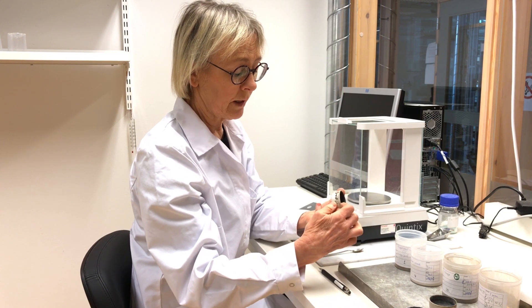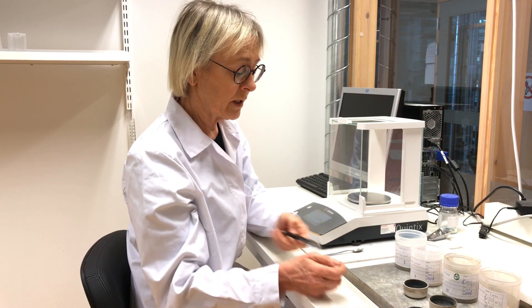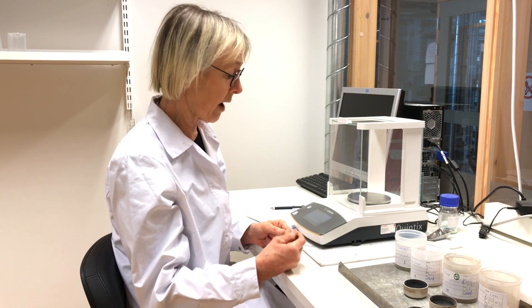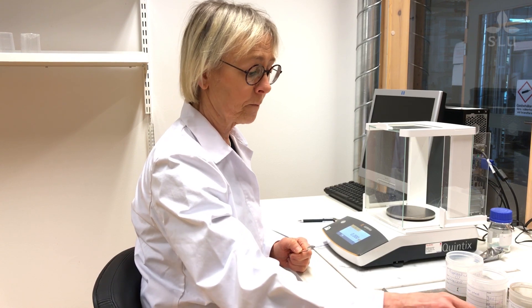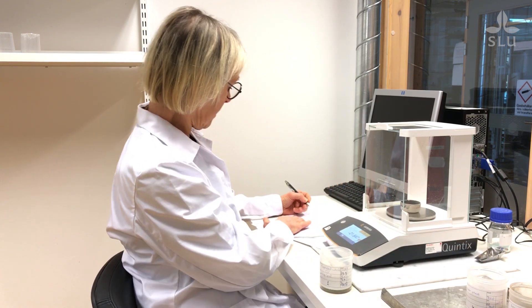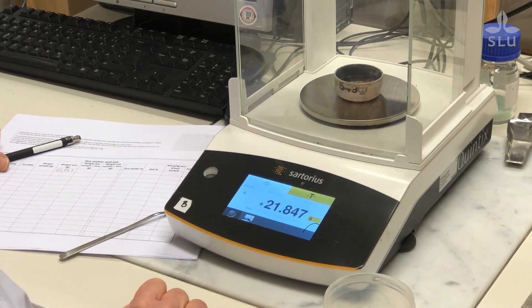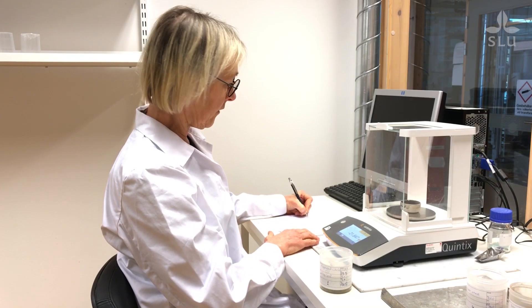We weigh the sample into a porcelain crucible which looks like this, and we need approximately one to two grams of sample — usually we use two grams. When we analyze dry matter we use a balance with three decimals, so it's capable of weighing one milligram. I place the crucible on the balance and record the weight of the crucible, which is the tare weight — in this case 21.847 grams. It's number 549.